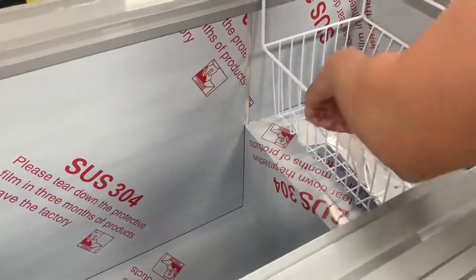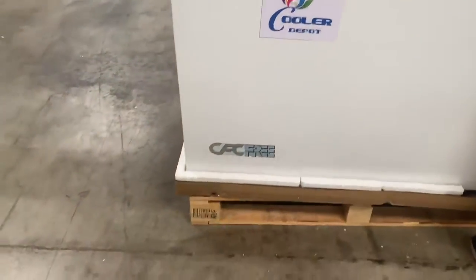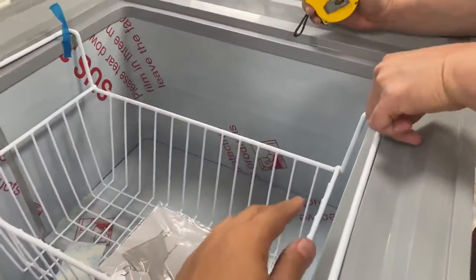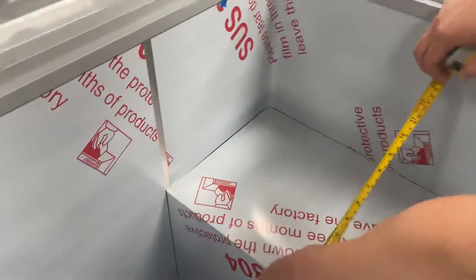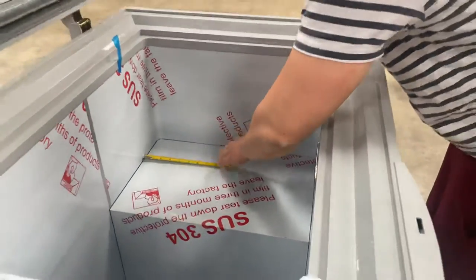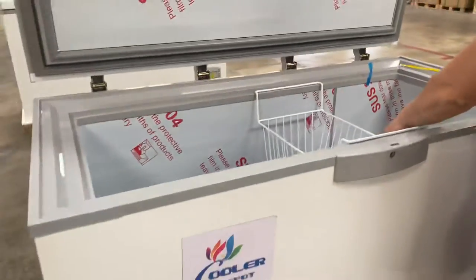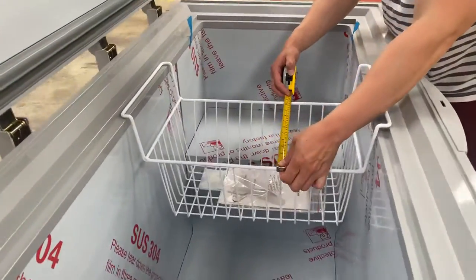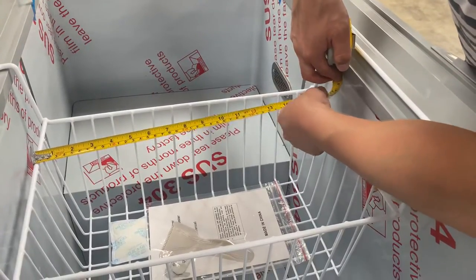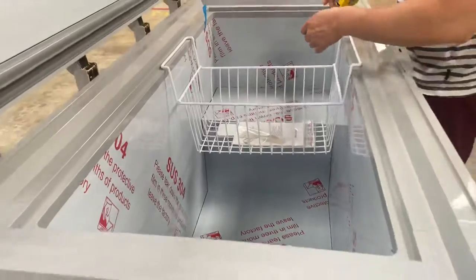Last but not least, let me show you the dimensions of the step itself. The step length is 11 and three quarter inches, and the depth is 18 and a half inches. Now for the basket: the length is 10 and three quarter inches, the depth is 16 and a half inches, and the height is six and three quarter inches. Those are the measurements of the basket.